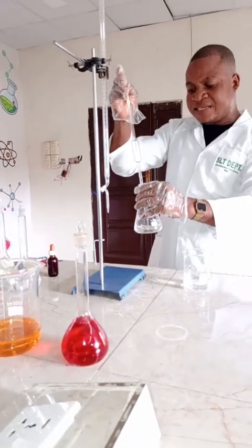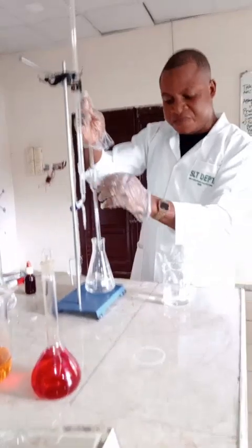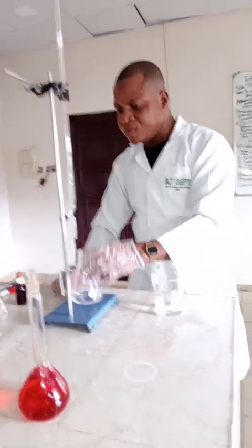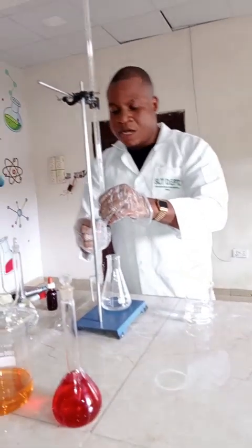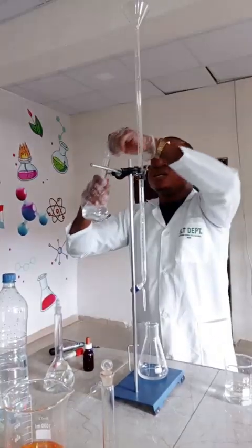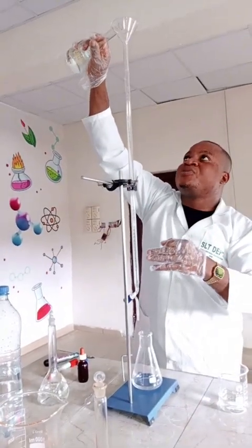This is my titrating flask, the conical flask. I've pipetted 25 ml of the base. I'm going to tighten my tap while I introduce my acid with the aid of the funnel into the burette.